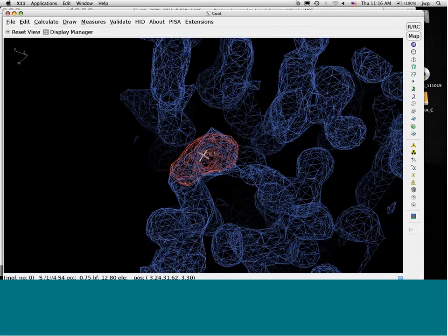Yeah, one of the things you can do with difficult data to process is post to the CCP4 newsgroup, for example, and a lot of people will jump in and help you. Certainly at Rigaku, people can send us their images and we will look at them. It's better if you're a customer of Rigaku and using our equipment, but I know that we look at many beamline images for people. Life is too short to not bring in an expert when you're struggling.